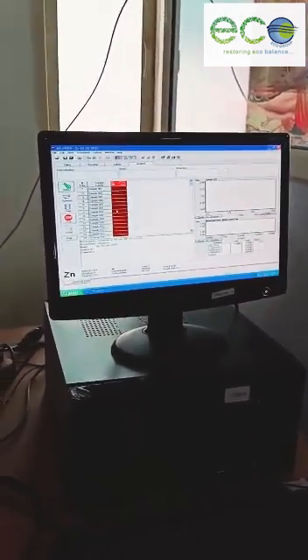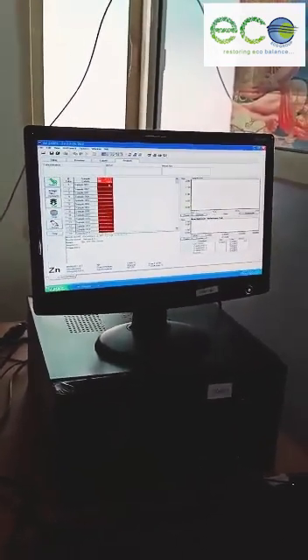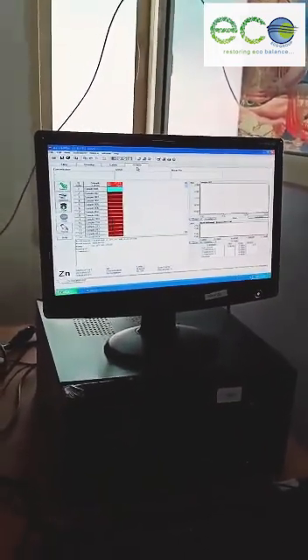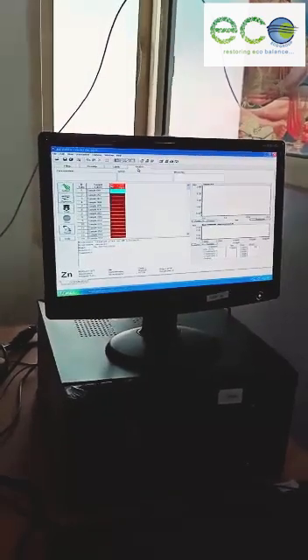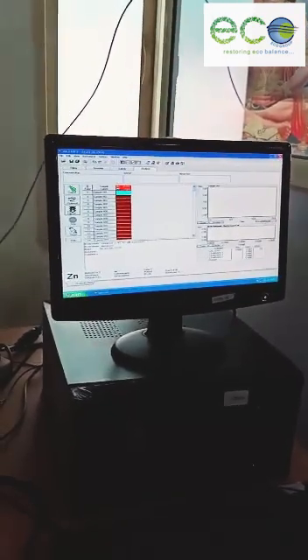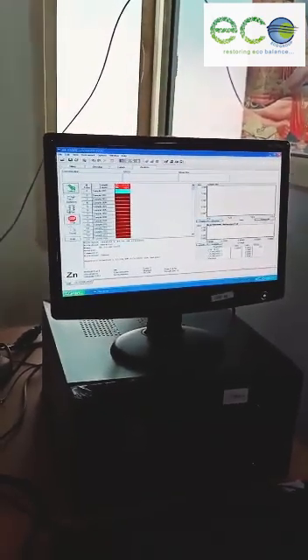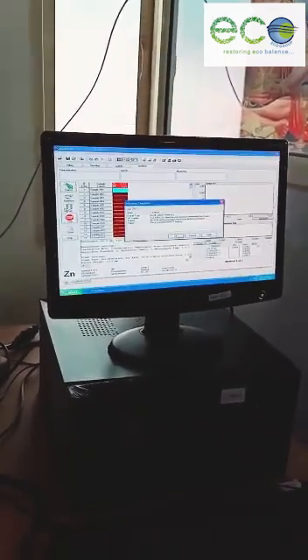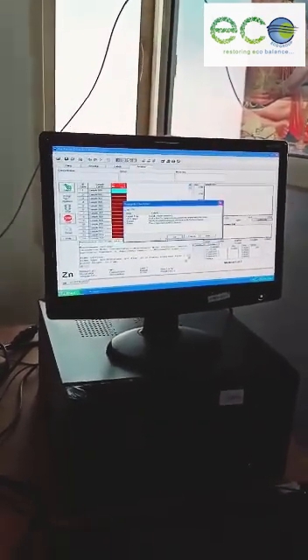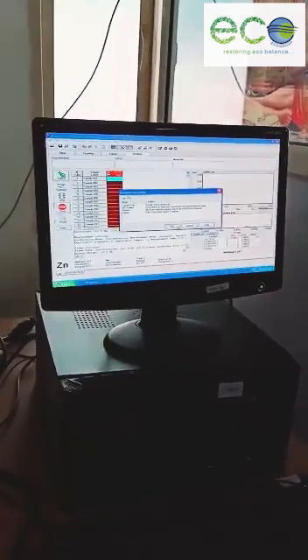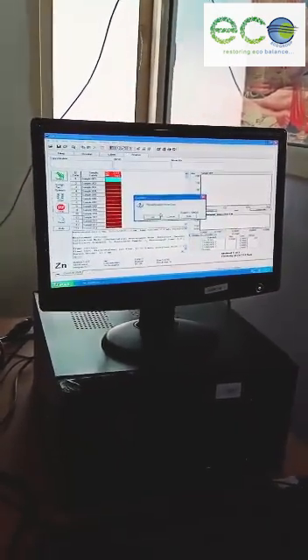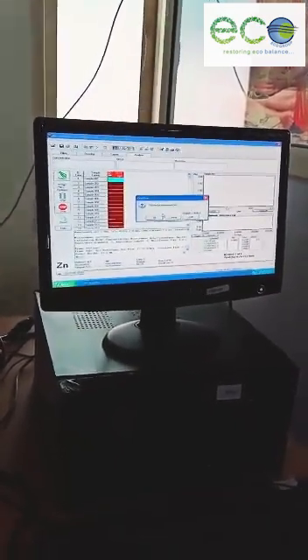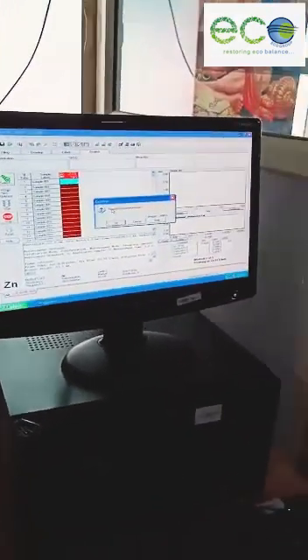Once we are done with the settings, we will go to the analysis part. Here we are going to start, and we will prepare a calibration curve.